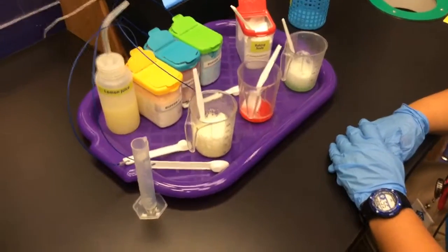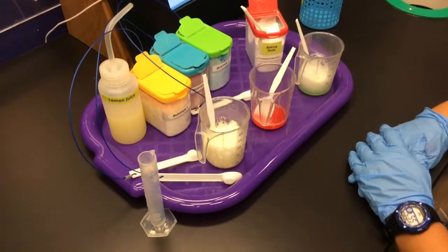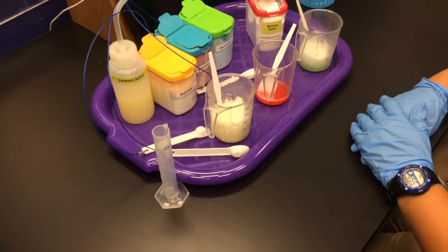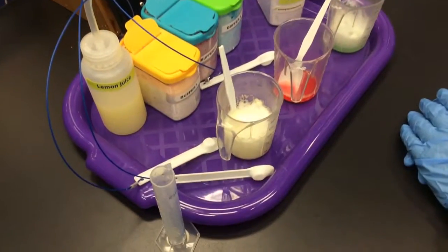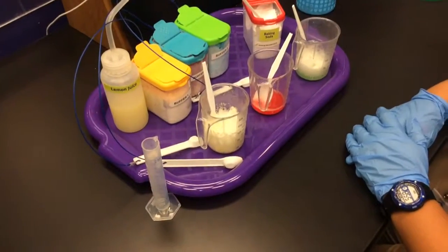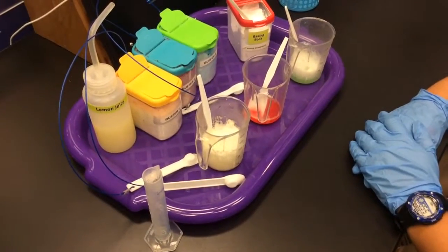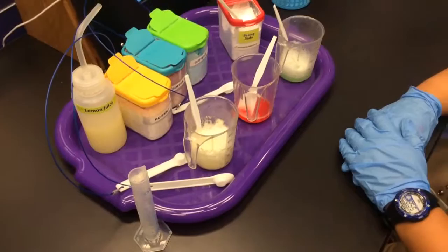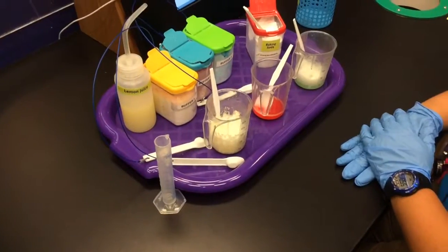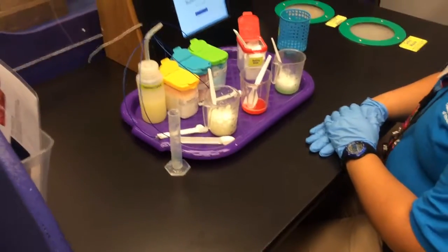So I think we have determined the best buffer from these samples, and it is buffer 1. This buffer has produced pretty tough bubbles, which still have formed for a longer period of time than the other two. And the secondary observation that we made is the reaction time. We are unable to hear very much from the first sample. The other two, we can still hear the neutralization reaction, which means that that buffer was able to even out that neutralization reaction.